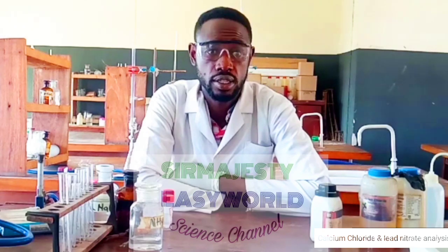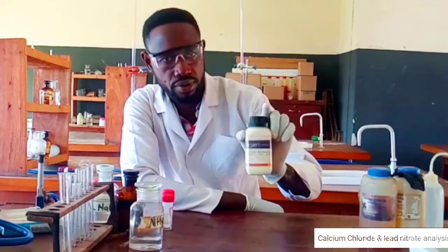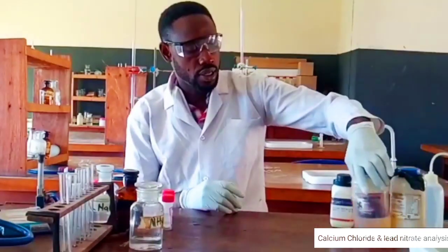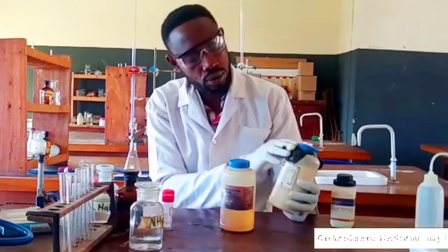So today I'll be analyzing two salts separately, and actually I'll still mix them together. The two salts I'll be taking a look at: this salt here, lead nitrate. Then here is the other salt, calcium chloride. This looks so local.